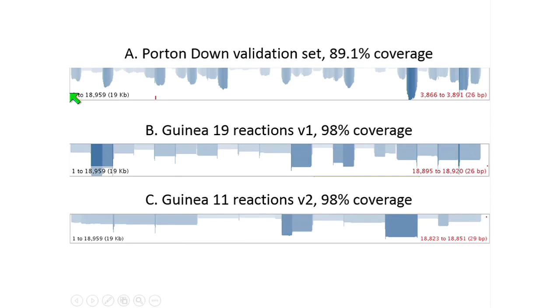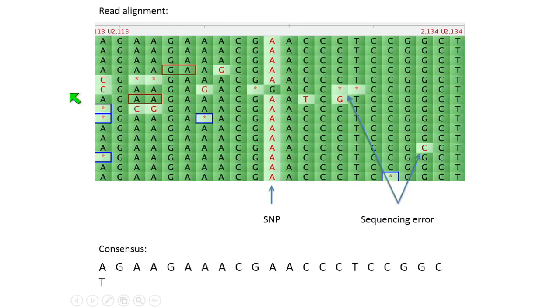We did find it was possible to go longer, but we were dealing with samples with quite a varying amount of Ebola. And of course, the less Ebola there is, the more fragmentation, the less starting material, the less likely you are to generate long products. So 2 kb products seemed like a sweet spot.